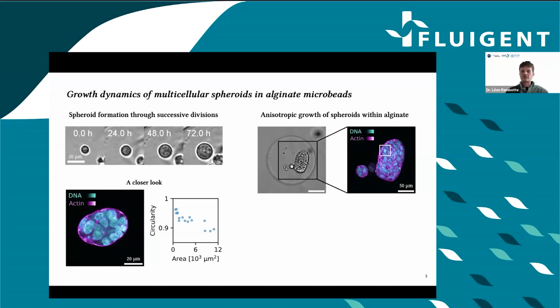We also managed to get spheroids with the MDCK cells, and of course, stem cells are a bit more complex to work with, but what we wanted to show here is that even if you use native alginate, which is not functionalized, which cells do not adhere to, and which is not, in this sense, completely ideal for the growth of complex cell types, we still managed to encapsulate them. And with developments on the matrix, with a bit of functionalization of the alginate, we could grow virtually any cell type we like.